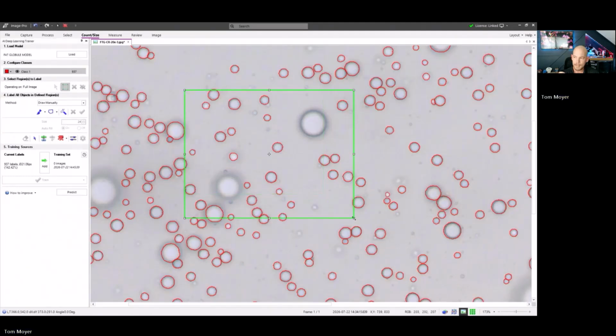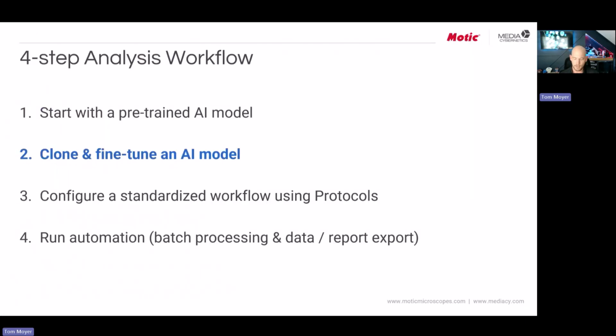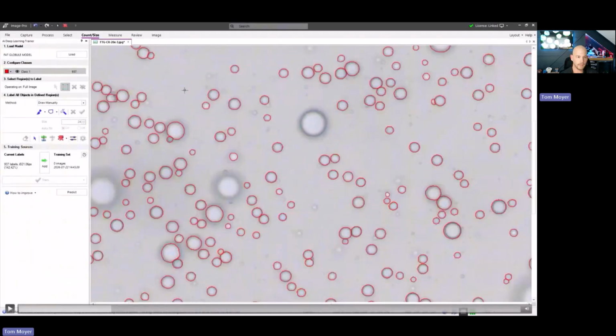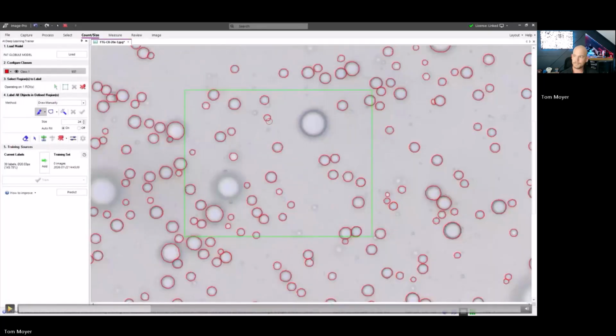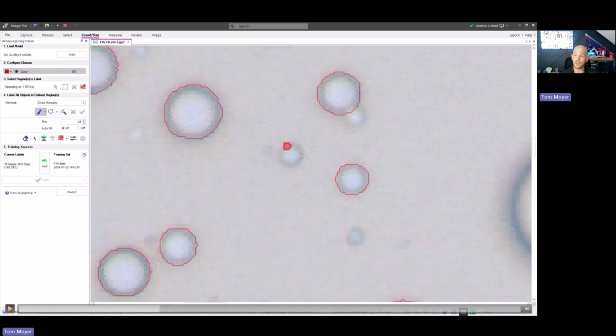And it would actually take quite a long time. It's deceptive if you're not zoomed in. But if I had to label everything within this image, it would actually take quite a long time to do. So we give you the ability to draw this region of interest. If I back the video up a little bit.